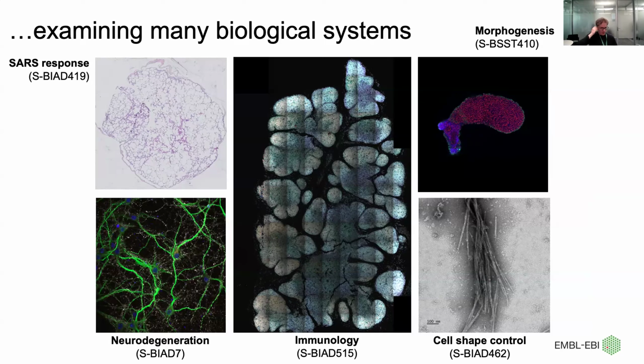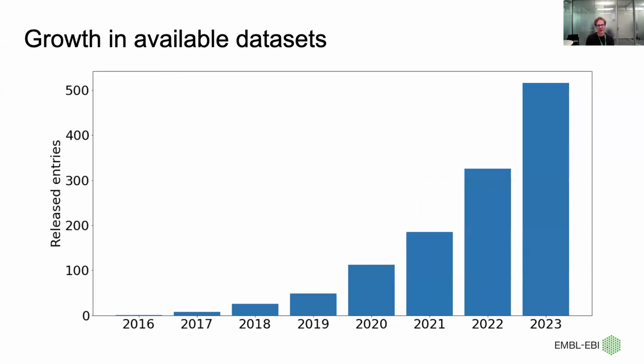I think this is relatively unique about the BioImage Archive, in some ways completely unique globally: it is a deposition database that will take your imaging data more or less no matter what you're doing outside the medical space. The archive started, as I mentioned, in 2019.